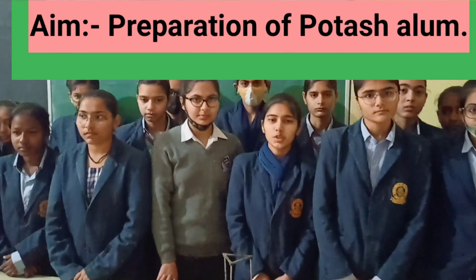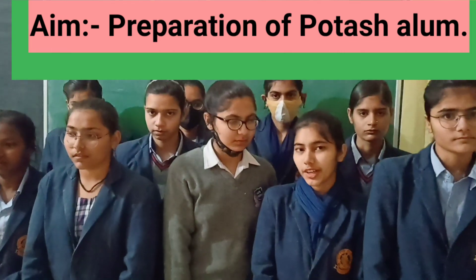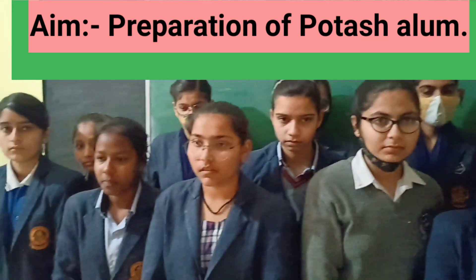Hello everyone. Today our experiment's aim is to prepare potassium aluminium sulphate, or potassium alum — in other words, we can say that fit curry.